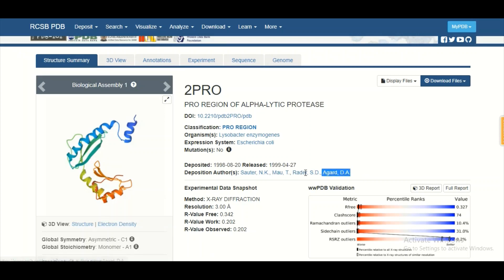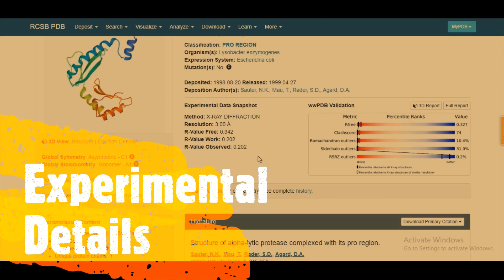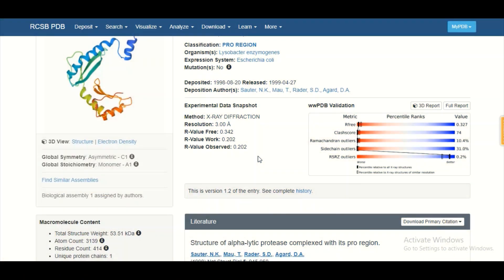After that, you get an idea about the names of the authors who contributed to the determination of this structure. Further down at the bottom, you can see the experimental details. The first important detail is the method used to determine this three-dimensional structure, which is X-ray diffraction analysis. We discussed at the beginning of this session that there are three methods: X-ray crystallography, nuclear magnetic resonance, and cryo-electron microscopy. For this protein, X-ray crystallography was used.